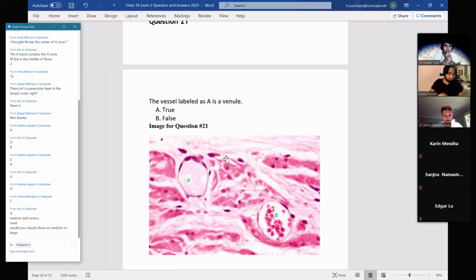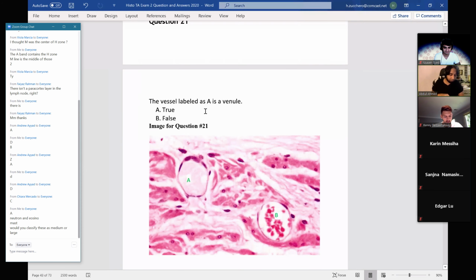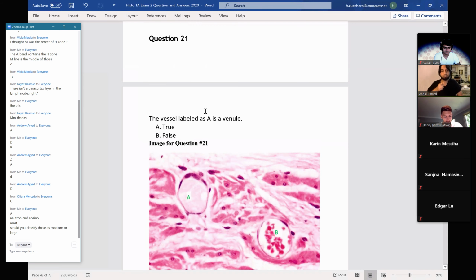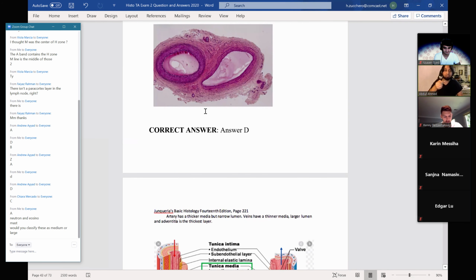So for those specifically, I would call them large, just because the tunica intima looks really big, but I'm not entirely sure on that. I would definitely check your notes. From this image, I think they were the large arteries. But usually it's the vasa vasorum that's going to tell you if it's a large artery, because they need their own blood supply. That's how big they are. So I would definitely check again on that, but I'm not entirely sure for this image.